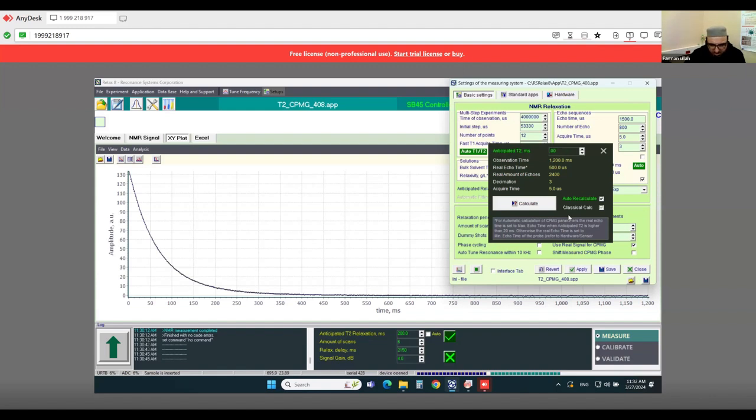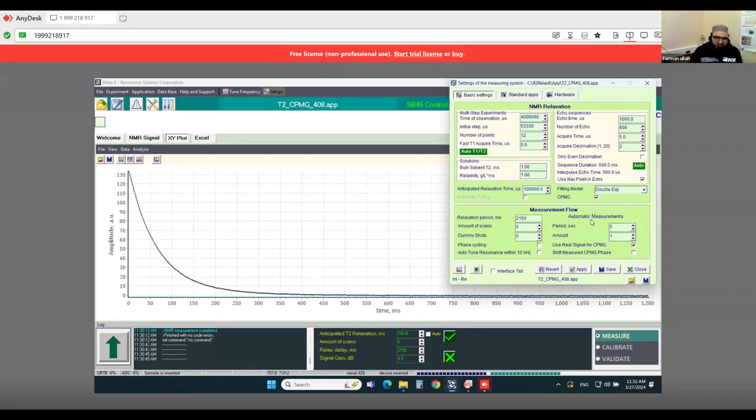So I will choose different values, at 600 millisecond. It goes to here. Let's see, we can check at this point also. But after this, it is some random things which you will play with the machine with your data setup.